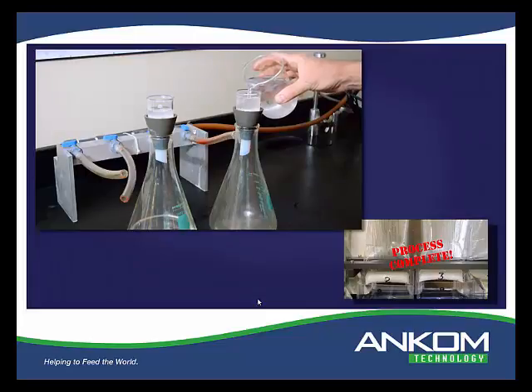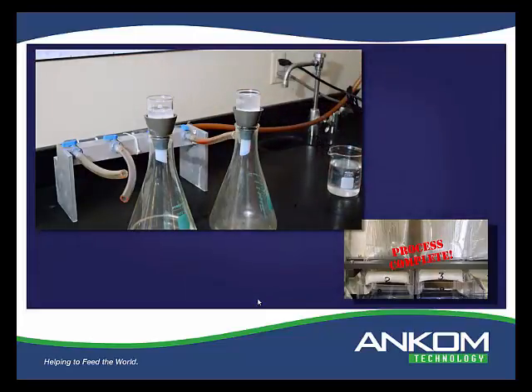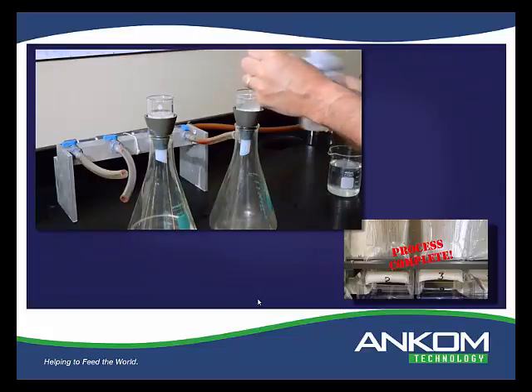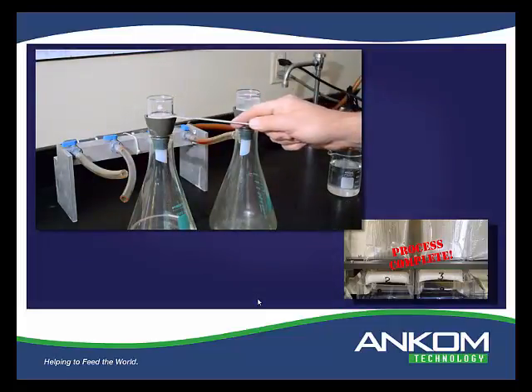But I have to be honest with you and tell you that when I was doing the conventional method, in the beginning I was being very careful just to scratch the surface of the gel as the method requires, because I wanted to do the method exactly according to the way it's supposed to be done. But I have lots of other work to do during the day, so I got to the point with the conventional method that I started digging in and actually going all the way to the glass because I just had to get it to speed up a little bit.